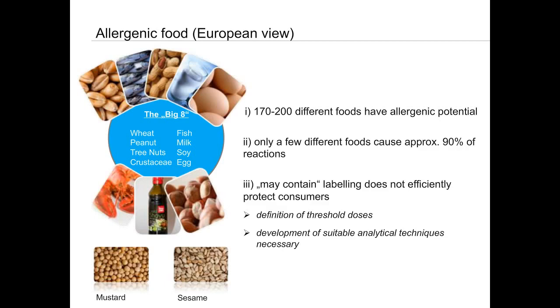So the basic approach was similar or identical compared to the food authentication. But we started with a far lower number of peptides as we only focus on the allergenic proteins, but ended up with a number of suitable markers for 6 different nut species. So we, in the first study, focused on the different nut allergens: hazelnut, cashew, almond, peanut, pistachio, and walnut. And then as we really do need to be really sensitive, as the eliciting dose of the most sensitive allergic patients is incredibly low, with something around 0.5 milligram total hazelnut and something around 1 milligram total peanut.